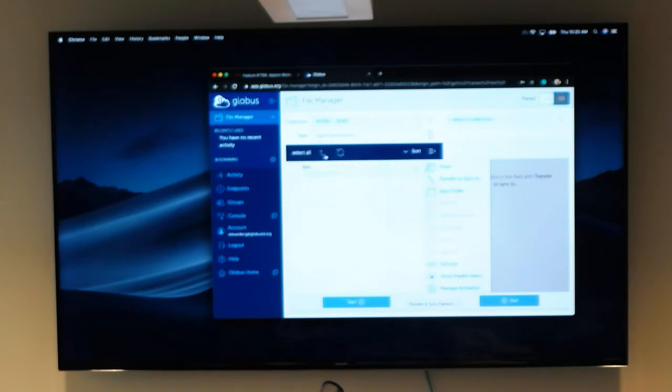And then lastly, what's in your Appion folder is all the pre-processing. So this is the scratch directory for the bulk of the pre-processing that you were doing during Appion Part 1. So you go to a Workshop I folder, you see the aligns, CTF, extracts, stacks, templates, and in case any of these files are useful, that's how you would download it. You can download it directly via Globus.